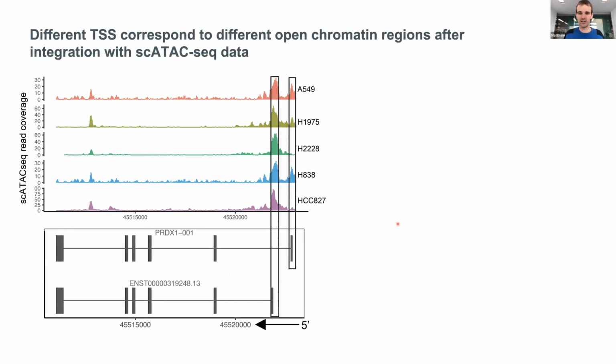I guess another application, if you happen to have this FLT-seq data and also on the same sample, different cells, but taken from the same batch of cells, we did some 10x ATAC-seq. So here you can see an example of a gene. There are 2 main isoforms detected in our data.